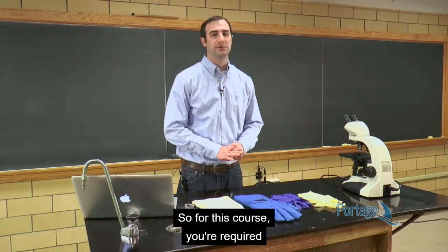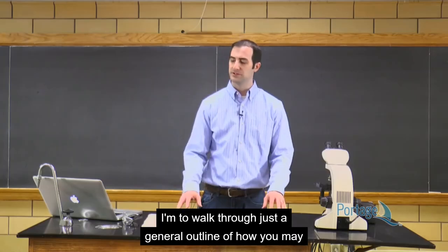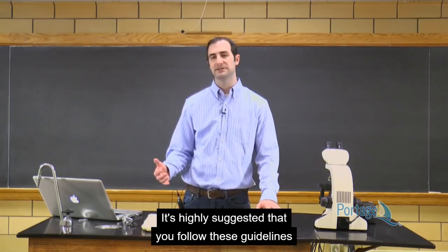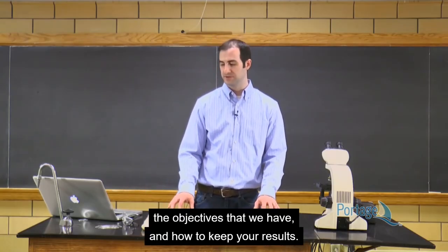So for this course, you're required to keep a lab notebook. I'm going to walk through just a general outline of how you may want to set up your notebook. It's highly suggested that you follow these guidelines. This will help you refer back to the lessons, the objectives that we have, and how to keep your results.